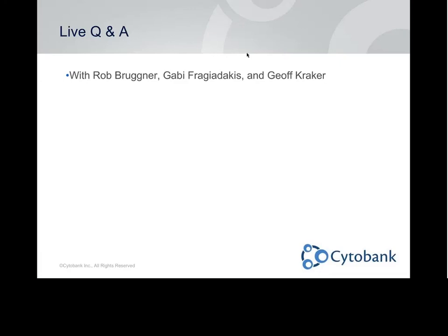Excellent. Thanks so much for sharing. Now we're going to hop into a few questions from the audience. So the first one is for you, Rob. It says Citrus clusters look a lot like SPADE trees. Does Citrus clustering work like SPADE?